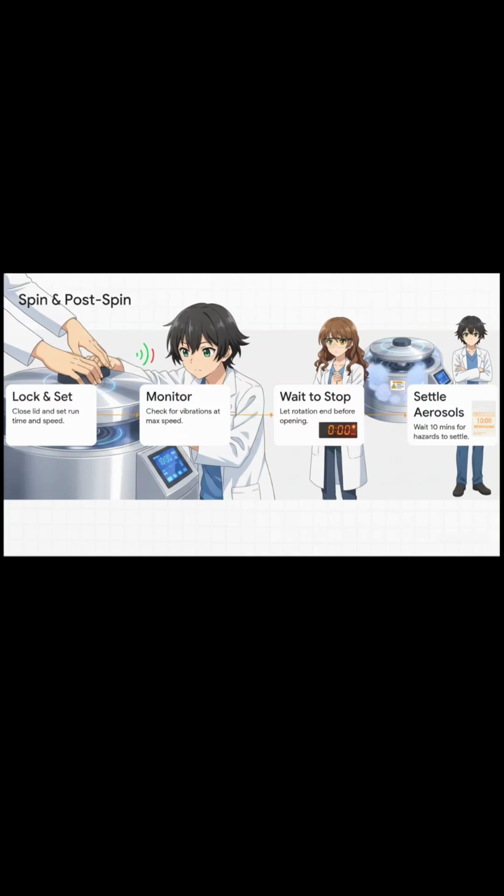When the cycle is finally over, you've got to be patient. Wait for the rotation to completely stop before even thinking about touching that lid. And actually, it's best practice to wait an extra 10 minutes before opening it, just to allow any potentially hazardous aerosols generated during the spin to fully settle safely inside the chamber.